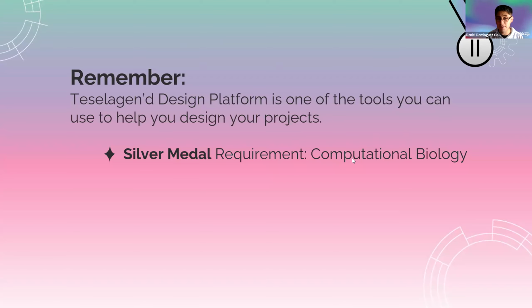Before we go, remember that this design platform from Teselagen is one of the tools that you can use to help you design your projects, and also to help you check the box of the silver medal requirements of computational biology.